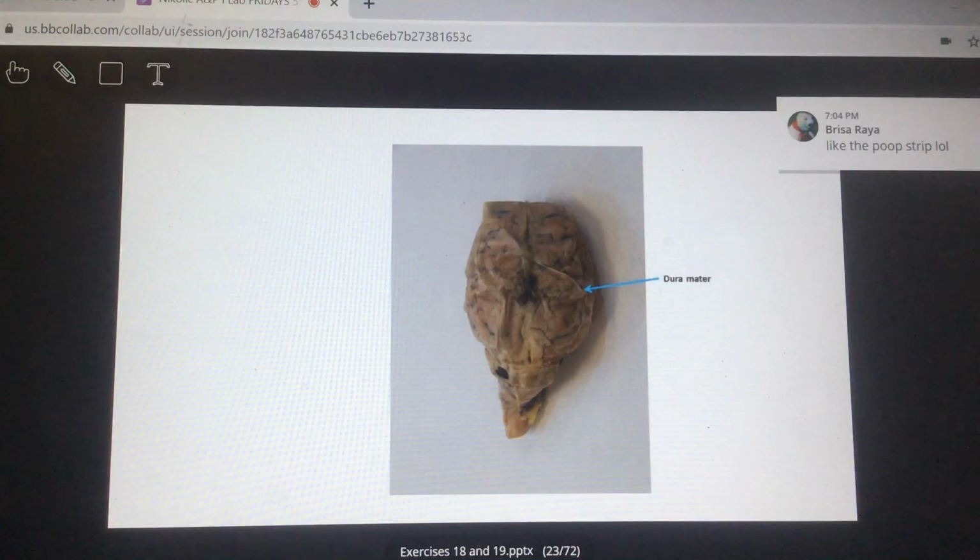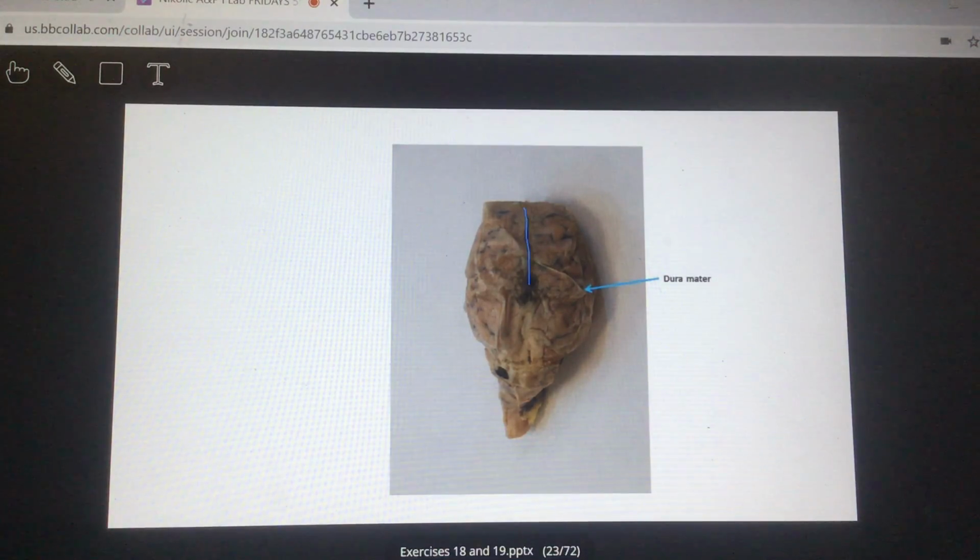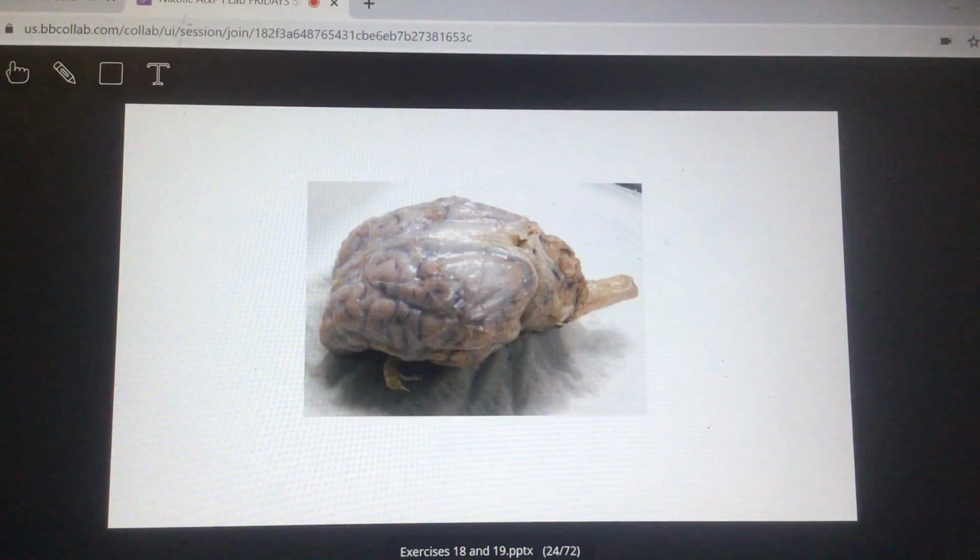That'll work. And it's usually going to be in this image because, like I said, it's a dark blue line at the top. It's right above that longitudinal fissure because that's where it is. It goes around the brain, right? All right, awesome. So let's keep going. Oh, by the way, where are we? Page 140, sheep brain dissection. Also, guys, you do have some labeled things in your book, which is great. So if you flip to 138 and 139, there's some labels there.